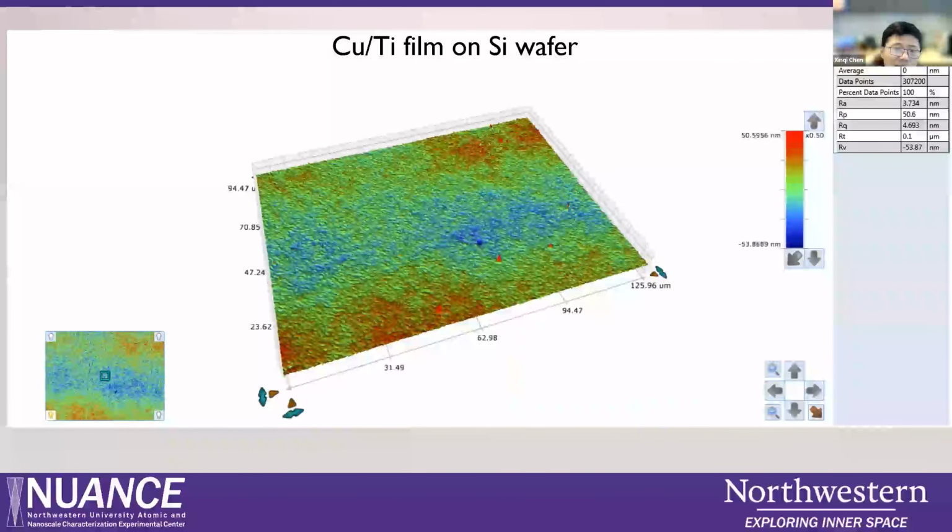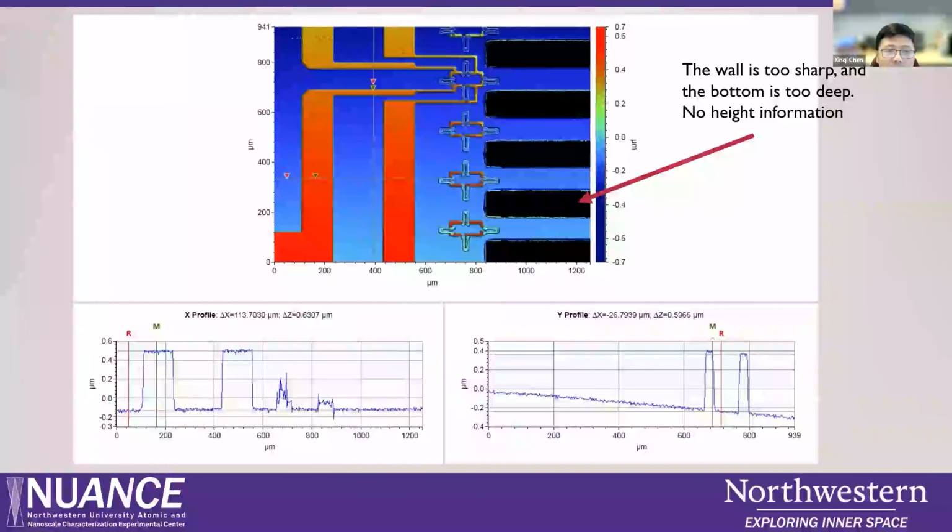So that is another sample, a copper film, a very smooth film on silicon. Based on the film, on the right you can see the analytical result. You can see we get the roughness. Some samples are special, like a film where you want to measure the roughness. Use this one, it is very quick, you can get this information. Okay, so next I will show this.